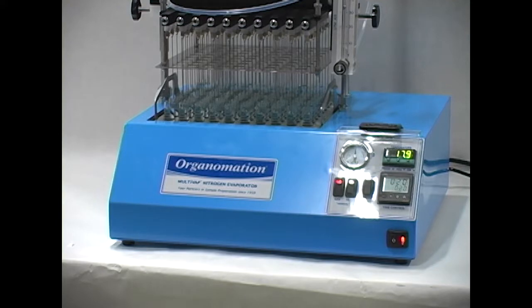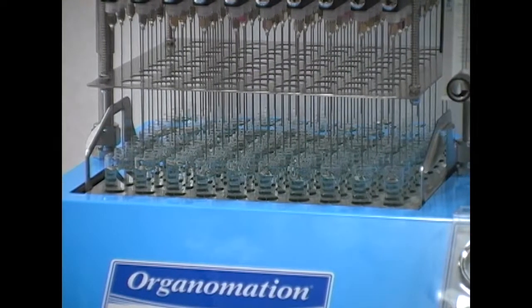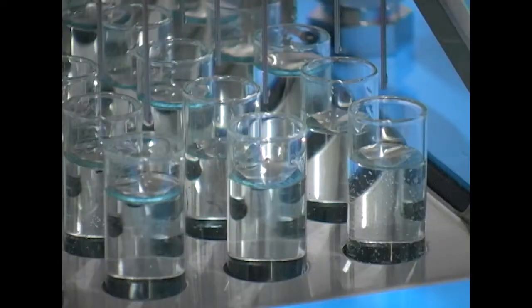Organimation's Multivap product line is an ideal choice for laboratories needing to gently and efficiently concentrate large batches of identical samples for a wide array of applications.